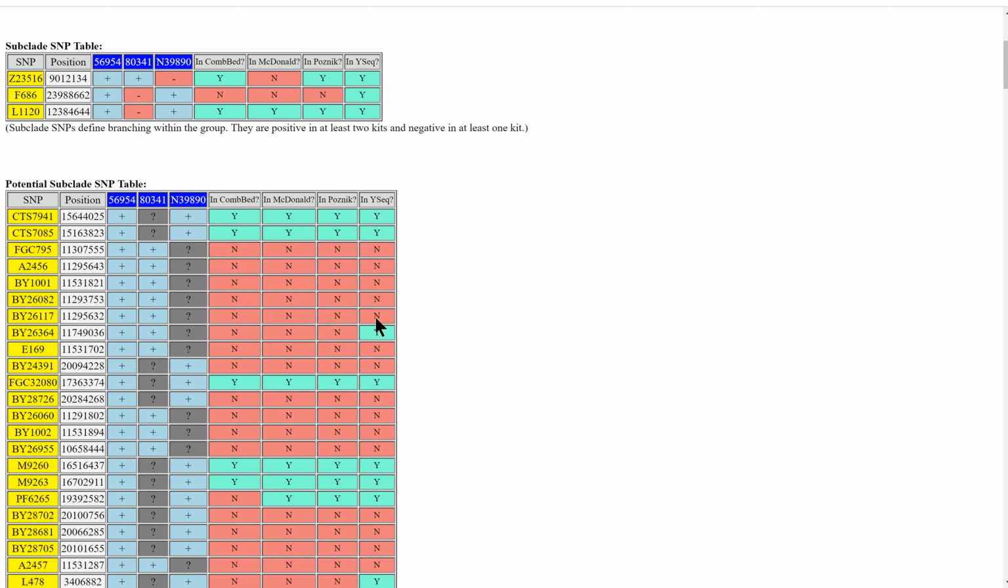Now, a lot of these are also, because I unchecked both selections, not in the quality regions, sometimes not in any of them. So for my purposes, I might want to know about these if they were not found in all kits, but I would probably not want to use the ones that are not found in the quality regions. So, you can make up your own mind here. That's why the tool allows these as options, so that you can take a look at this.